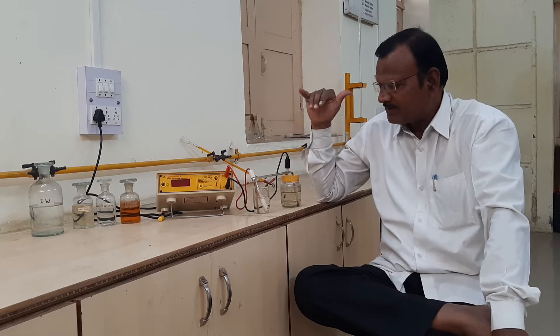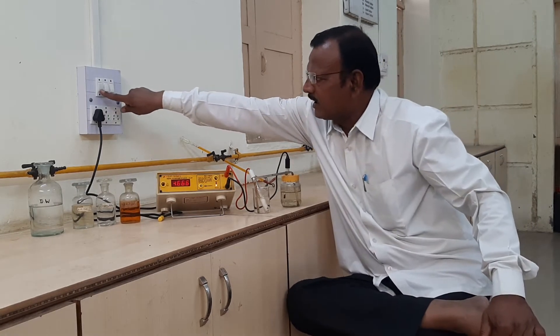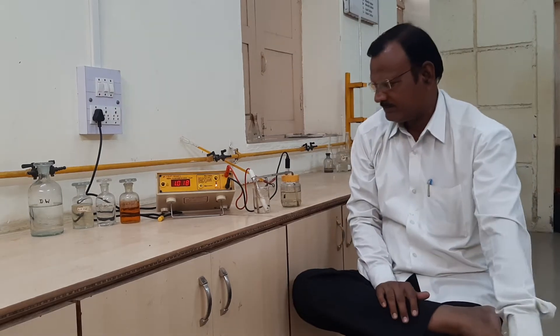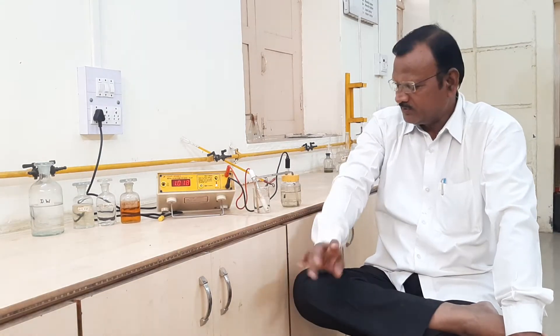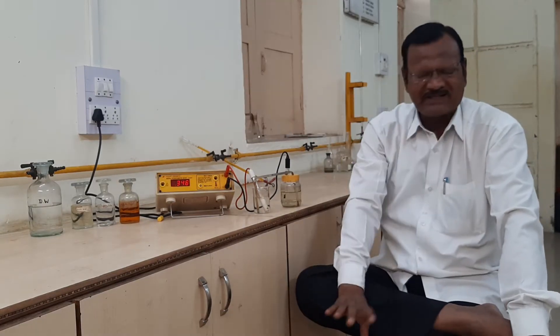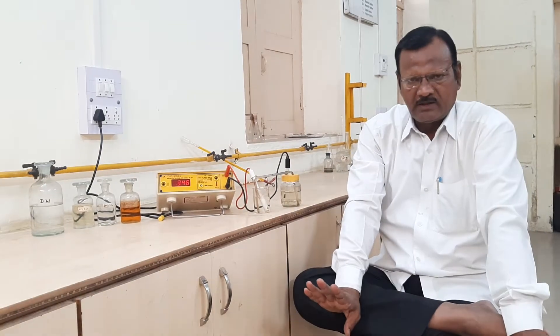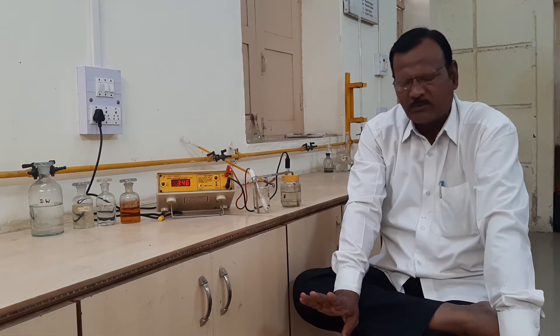First of all, we have to warm up this instrument by switching on that instrument, and we have to wait a few minutes to warm it up. Then, secondly, we have to calibrate this instrument. The standard value at 25 degrees Celsius of temperature — the EMF of this standard cell is 1.0185 volts.